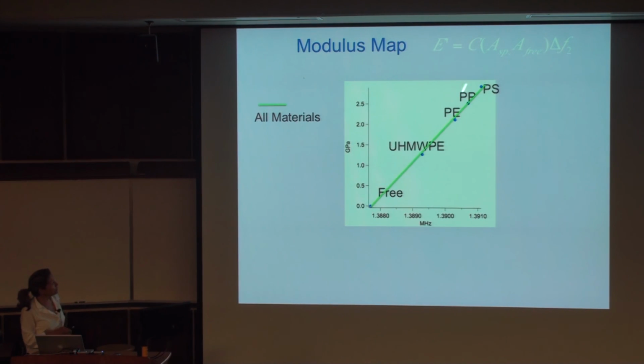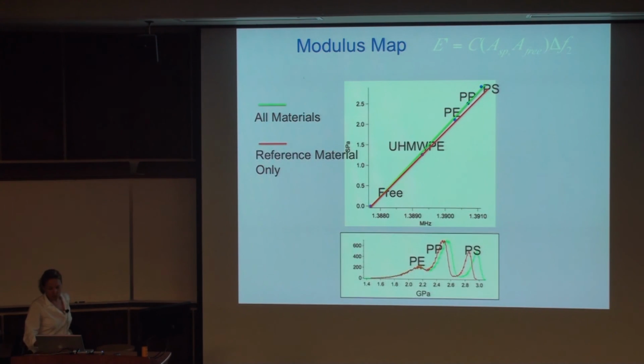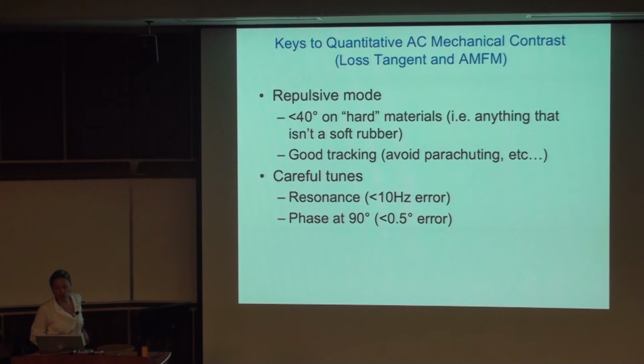Here I can just assume this very simple equation, knowing that the elastic modulus is proportional to the shift in the frequency. And this is the end result, where now I have values in gigapascals, because I was able to calibrate.